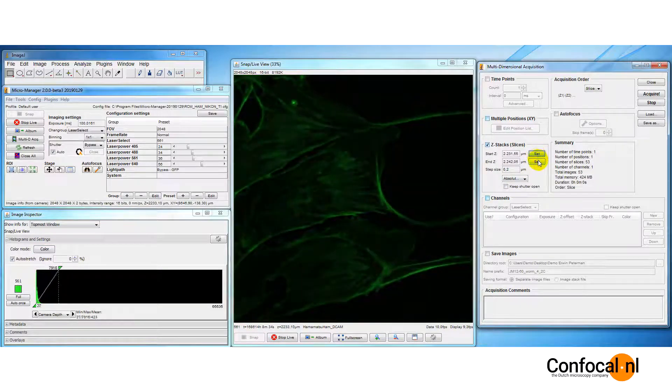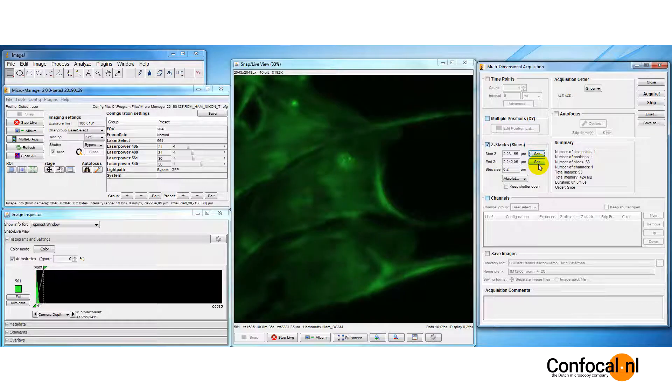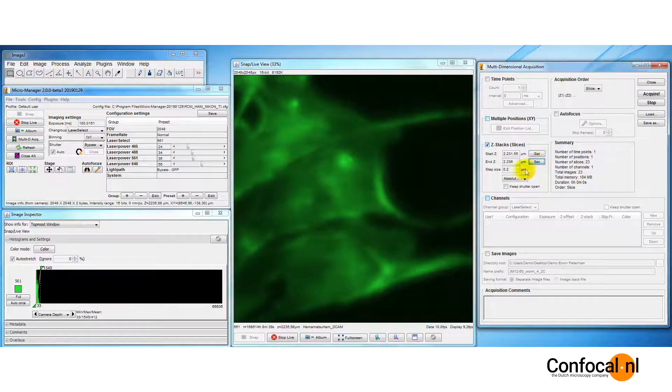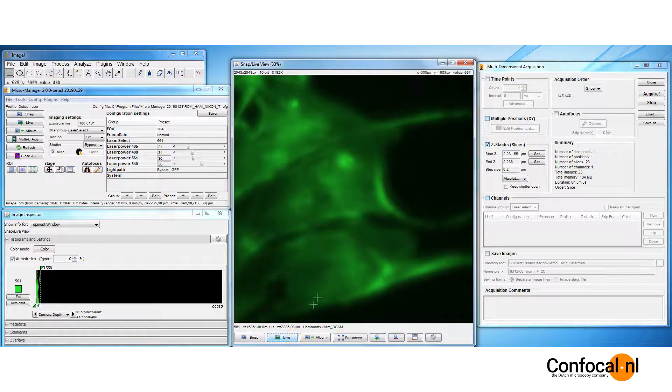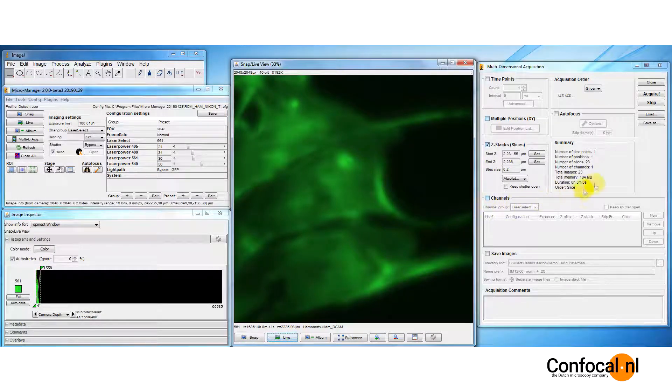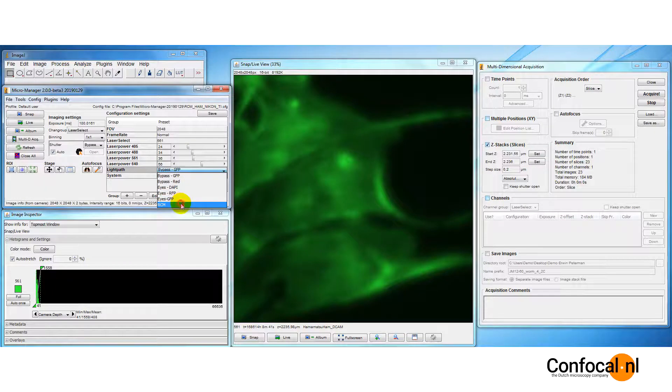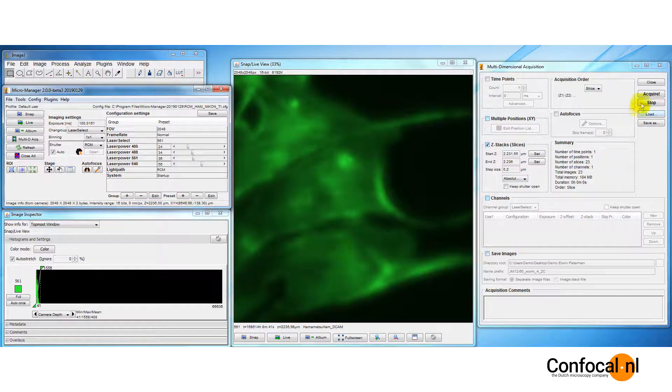Now, run the objective up to find the upper limit. Click set. Press acquire.